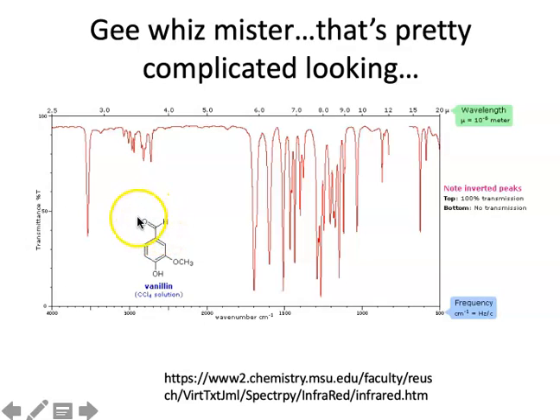Same thing here, right? This aldehyde group, we might be able to tell a little bit of something about that carbon in C13 NMR, but is there a way that we can really confirm that something is an aldehyde relative to like a ketone or anything else? And so that's what these slides are all going to be about.